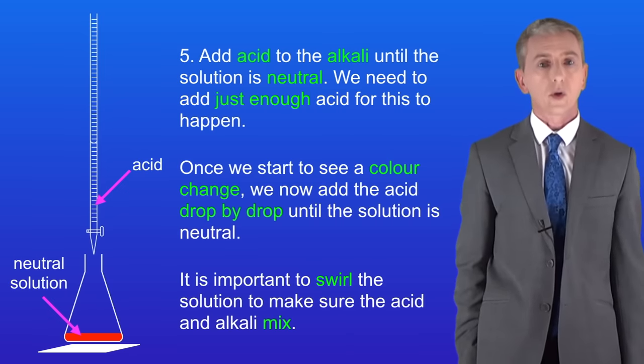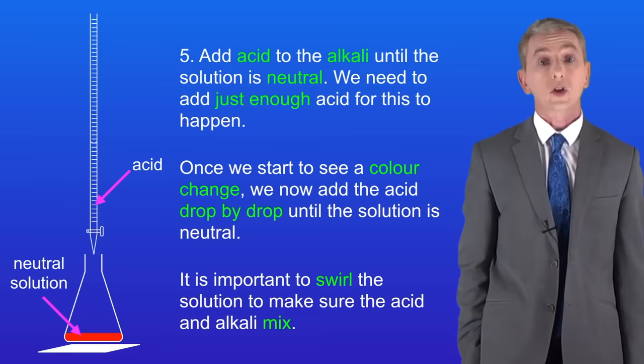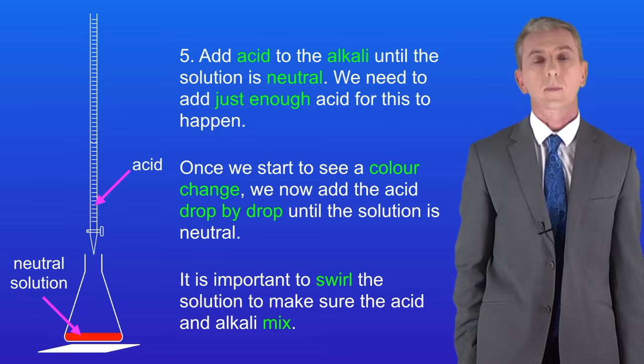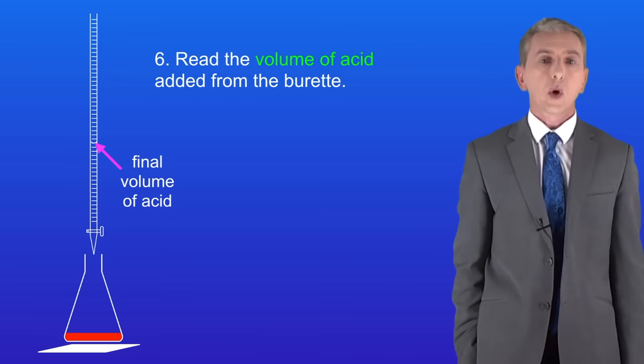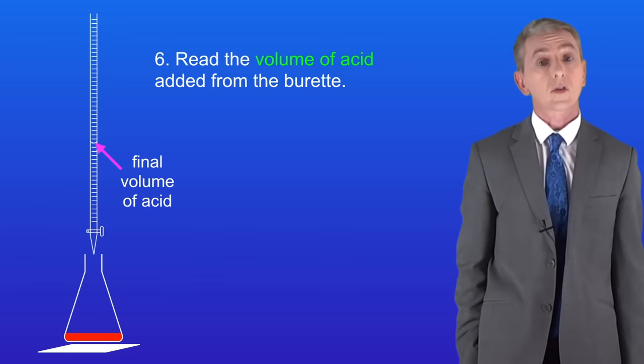I should also point out that it's important to swirl the solution to make sure that the acid and alkali mix. Finally we read the volume of acid added from the burette. It's important that this is done correctly so I'm going to discuss that now.